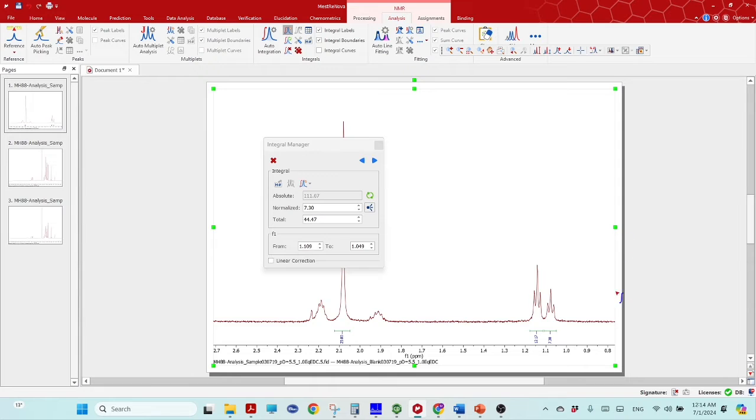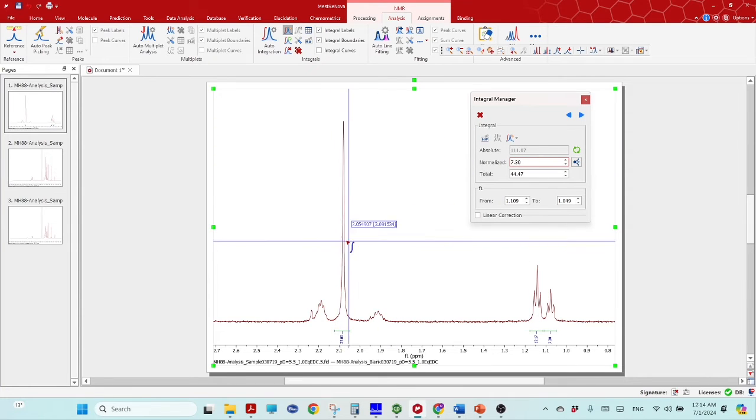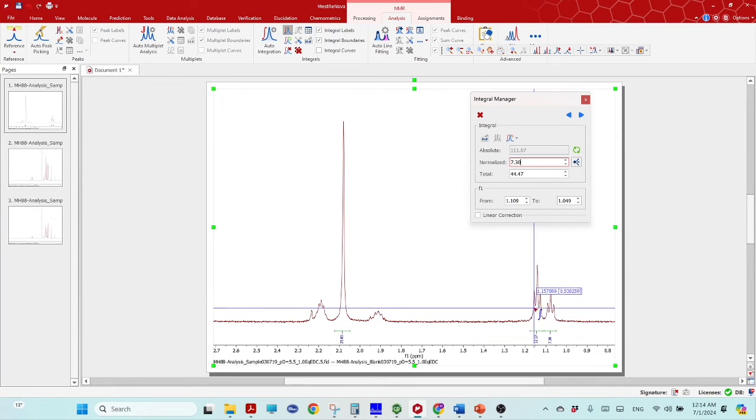This is the EDC, what I was talking about, and this is the urea, after the reaction converts EDC to urea. This was 25 millimolar, and the EDC was also used at 25 millimolar, but in the reaction EDC will always be decreasing and urea will be increasing. The DMA peak is for 3 protons and shows 25, and this EDC peak is also for a 3 proton methyl, and it shows 12.